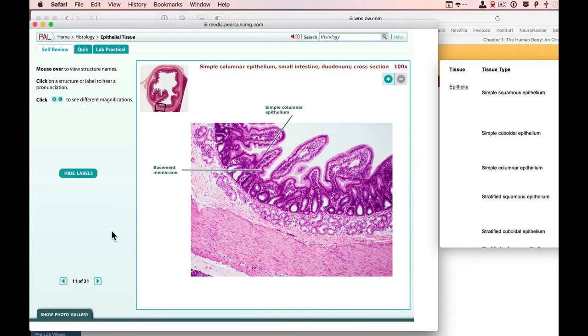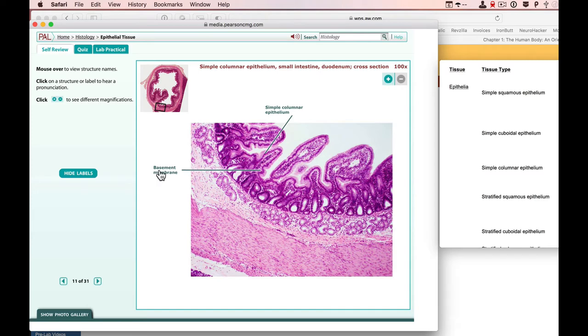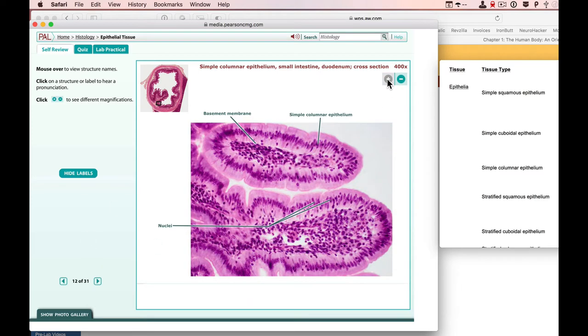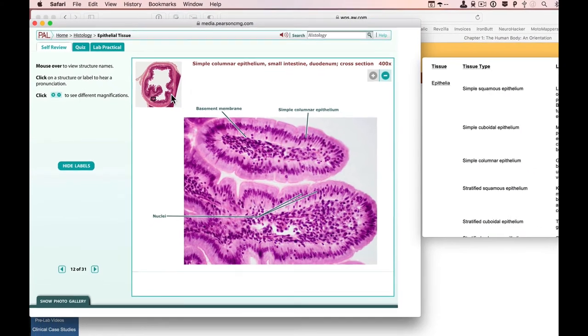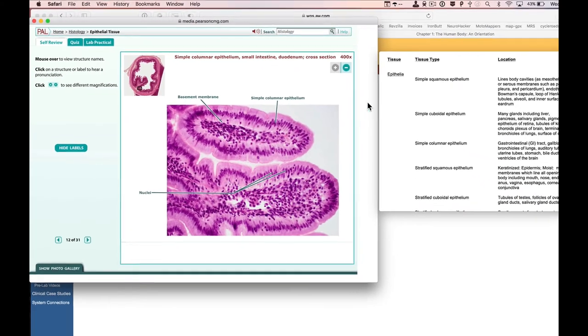This is getting us into some simple columnar right there. We can zoom in on that, which is actually the same as going to the next slide, but I'll click zoom in anyway. And again, there's simple columnar epithelium. And you can continue this.